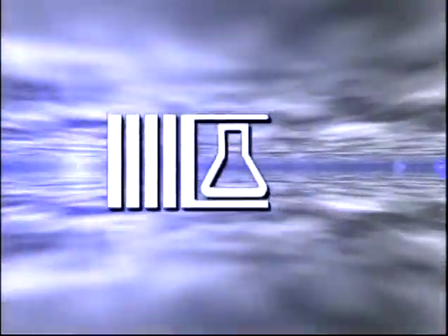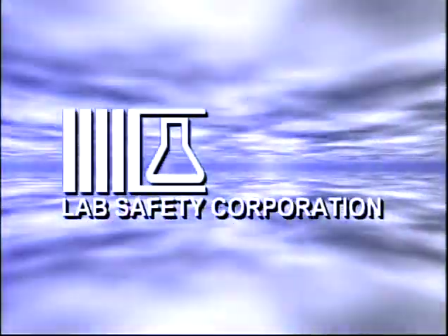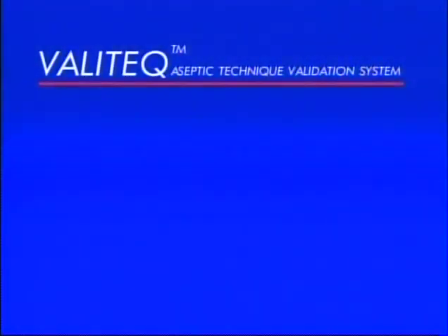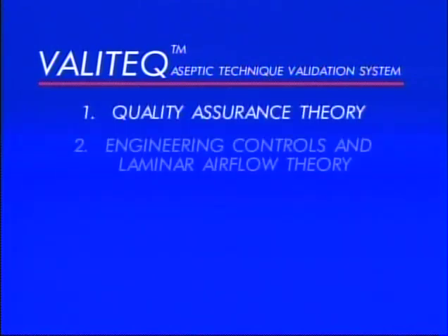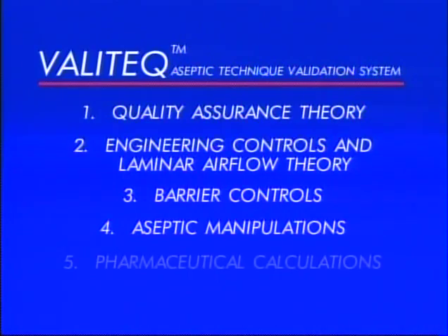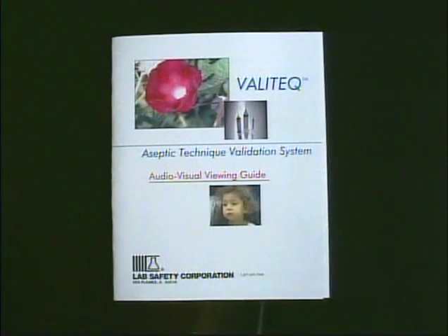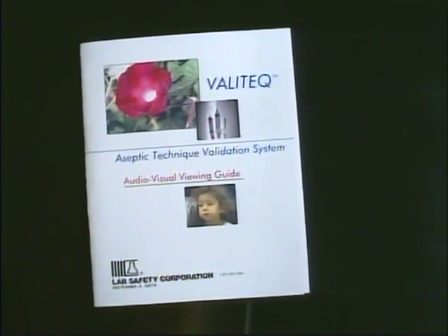Welcome to a discussion of IV admixtures compounding for the modern hospital and home health care pharmacy. This program is provided as the audiovisual component of the Valiteq Aseptic Technique Training and Validation Program and will be presented in 5 parts, consisting of quality assurance theory, engineering controls and laminar airflow theory, barrier controls, aseptic manipulations, and pharmaceutical calculations. An audiovisual study guide is provided as a training aid for taking notes while viewing this presentation.